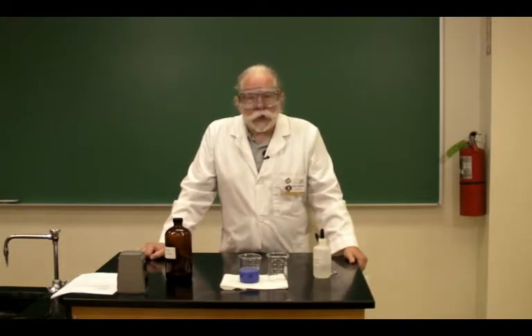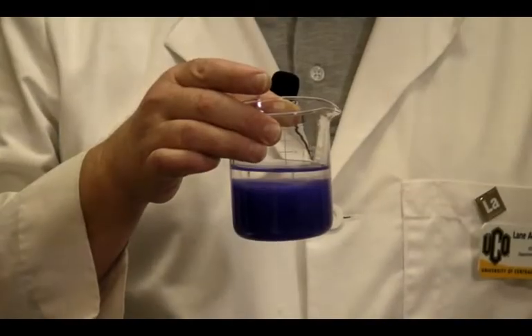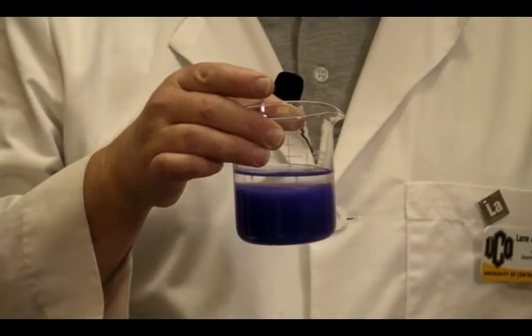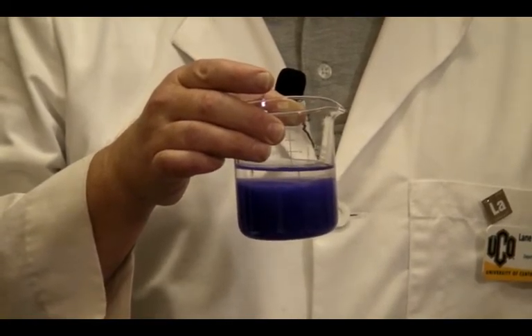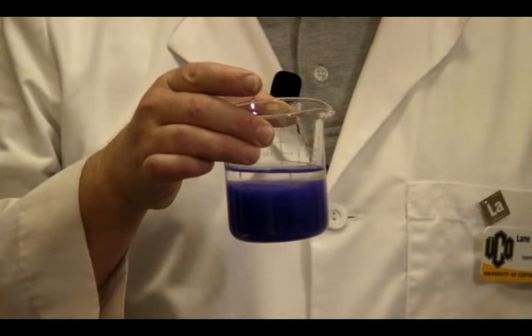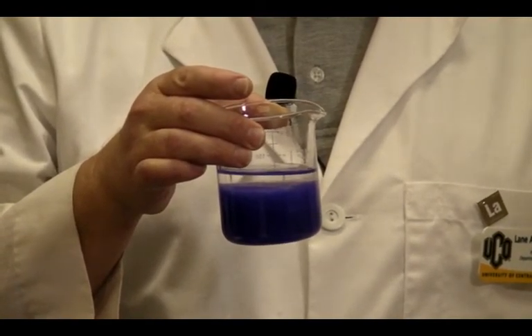We will come back to this in about 20 minutes to see that the solid material has settled to the bottom. Our 20 minutes have passed. You can now see the solid material has started to settle to the bottom. This is why we call it a precipitate, because it settles, like rain settles to the earth.